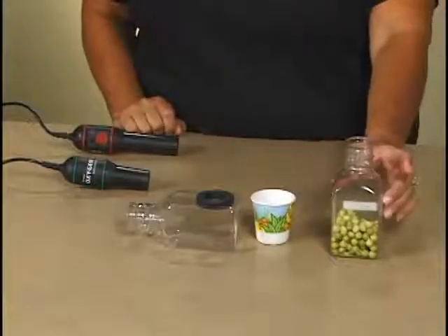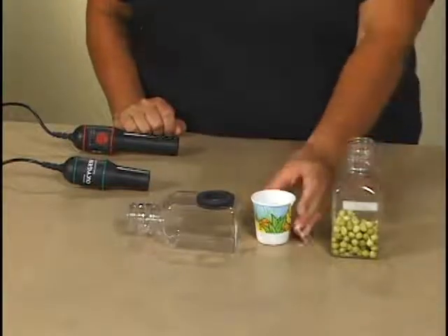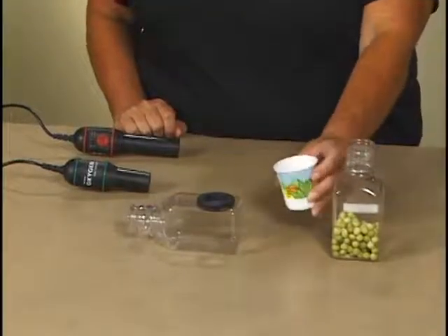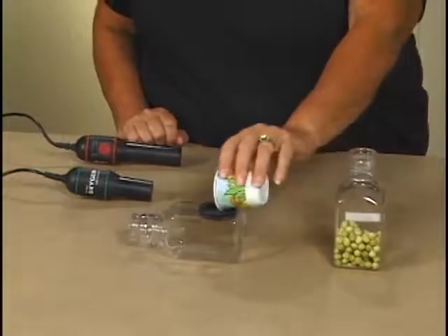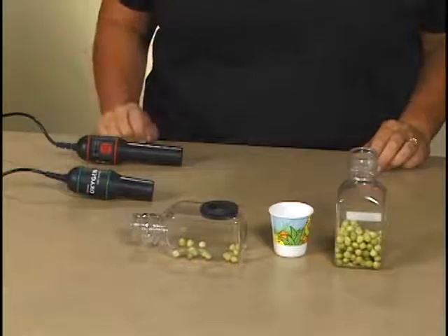I have some peas that have been soaking for a few days and have started to germinate. Measure out 20 to 25 peas and place them in the respiration chamber. Put your sensors into the biochamber.